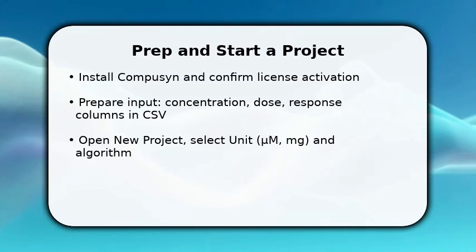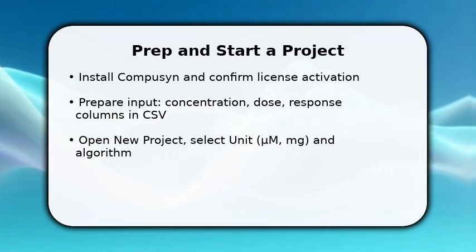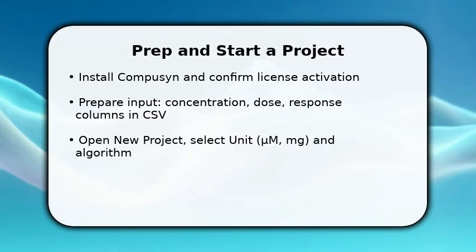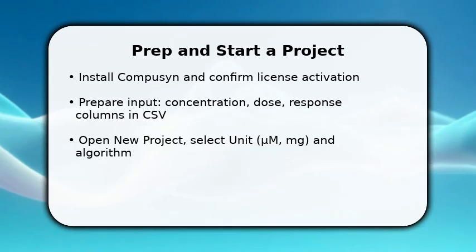You begin by creating a new CompuSyn project and importing your prepared CSV. This gets you into the workflow immediately. Make sure to select the correct unit and algorithm so calculations match your experimental design. Incorrect units cause scaling errors.